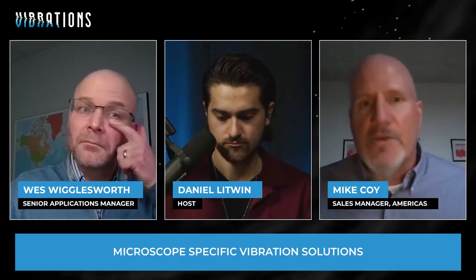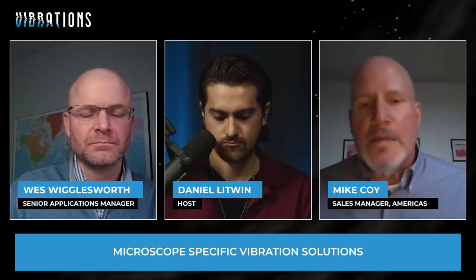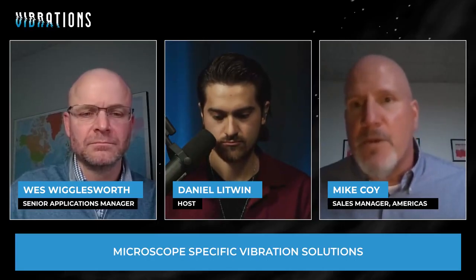Ergonomics, like you mentioned, Daniel, is an important thing that people don't think about at first, but the operator in some of these places might run this microscope for 8 hours a day. If you suddenly come in with a solution that changes the height of the column, but does not impact the console where the operator sits, you've changed his or her movements constantly.